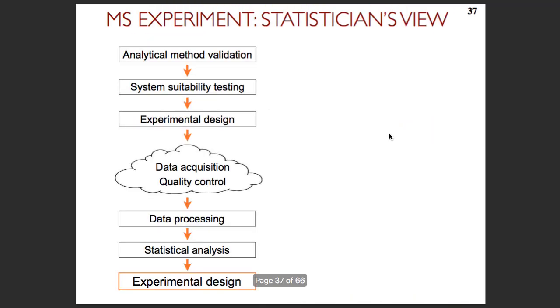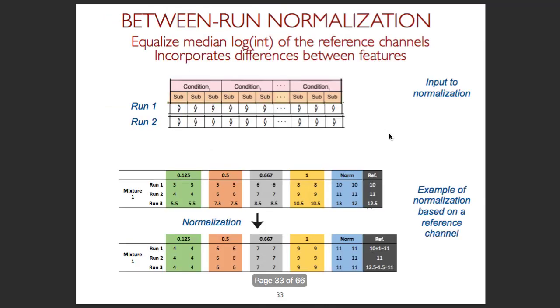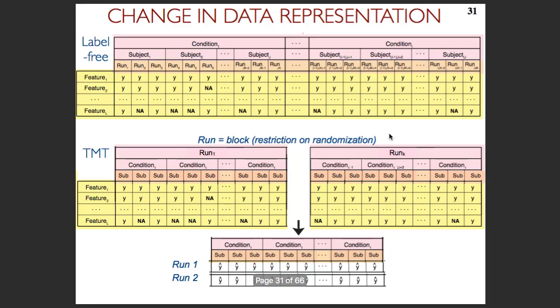Just want to clarify this experimental design. Yes. You have made a reference channel, right? That's right. Can be used eventually for overall normalization. That's right. Initially, you are doing each run-to-run normalization, and then you are using the reference channel for all normalization, or? No, normalization is tricky, right? Because you don't want to over-normalize your data. So you really want to do just as little as necessary, but not more. And we decided, based just on empirical evaluations, to take this data not normalized.